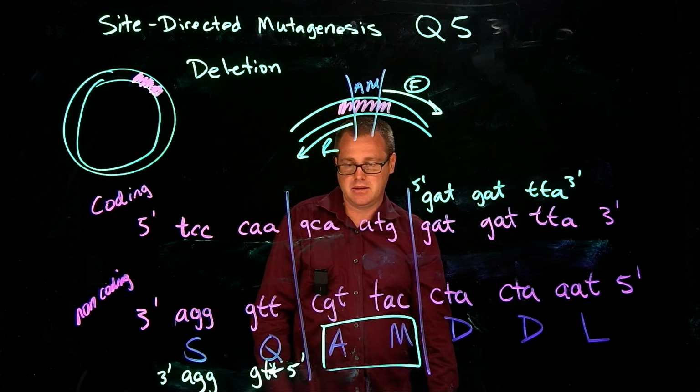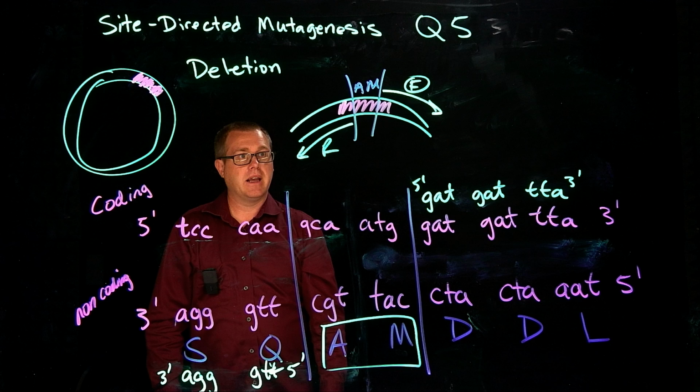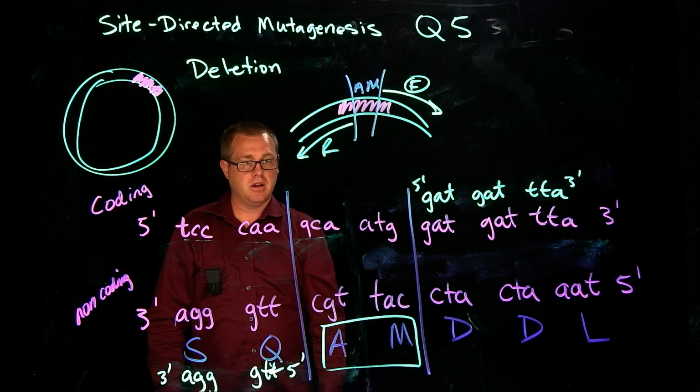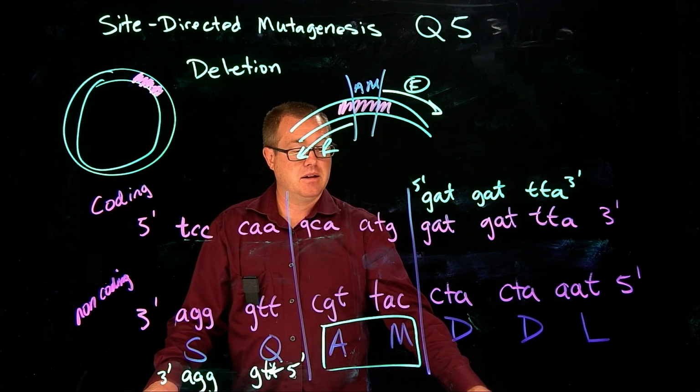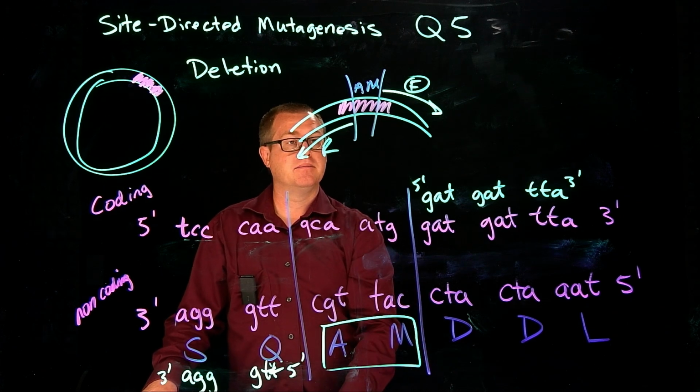And you get many, many copies of your gene that does not contain this piece.